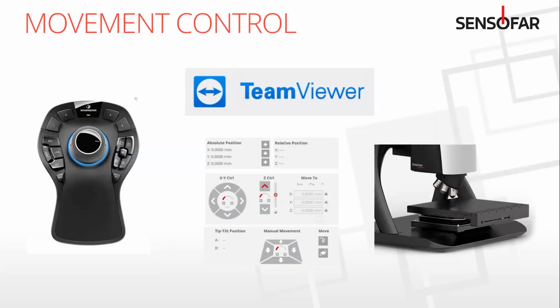In terms of manually moving the stage and controlling the microscope, that's normally done with the 3D space mouse that you can see on the left. However, all of those actions can also be mimicked by clicking. So that allows you to connect via TeamViewer, and you can remotely move the stage around and manipulate your sample.